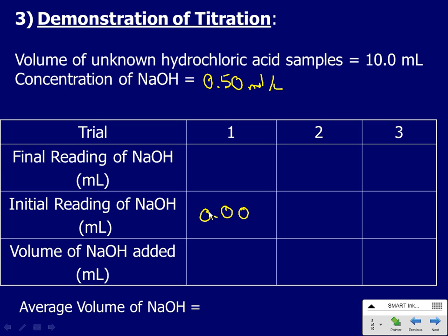This is a failed titration. Well, that's craziness. Garbage. Waste of time. I got to get new phenolphthalein. Yep, I'll be right back. It's crazy. It happened on Friday as well, and I thought it was my solution concentration. I'll be right back.